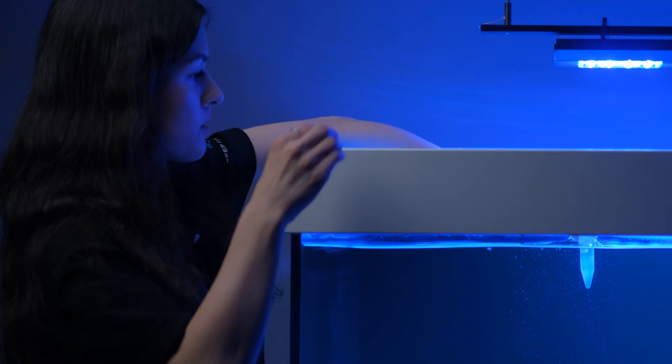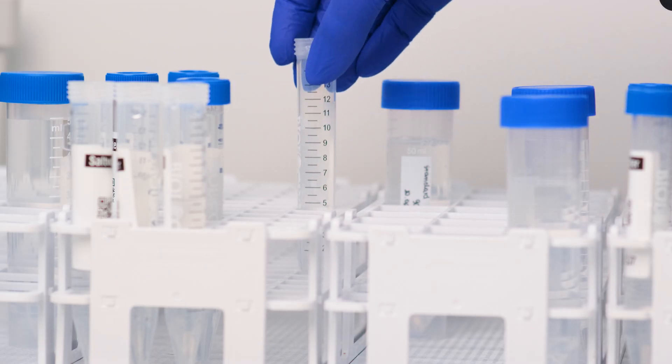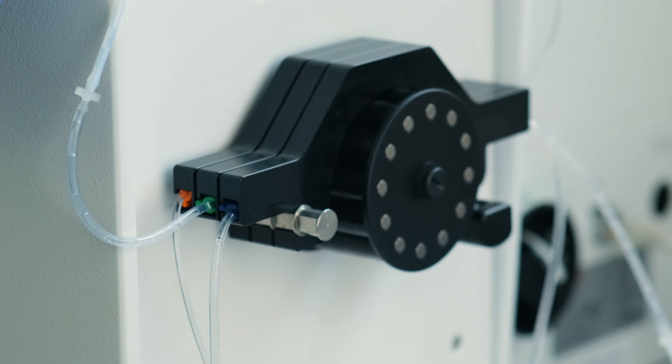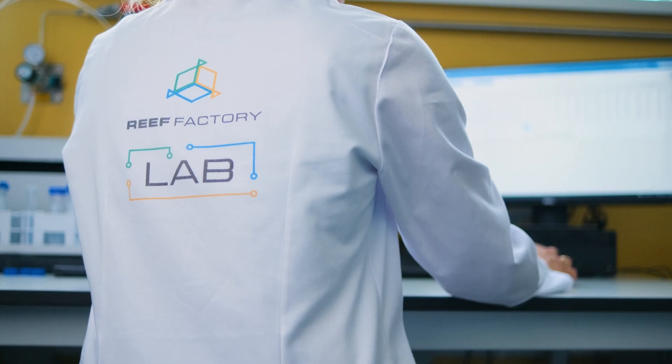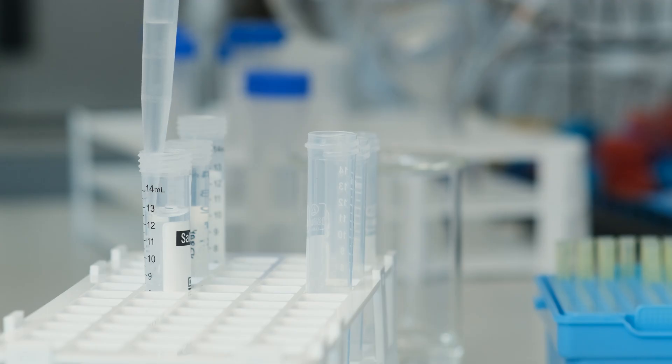Let's start by explaining what an ICP test is in general. ICP analysis is a laboratory analysis of seawater based on the test carried out using an ICP-OES device. It is a modern, easy to use and the most accurate way of testing fluids, including seawater, that's available to the aquarist.